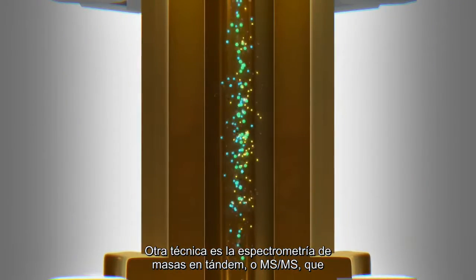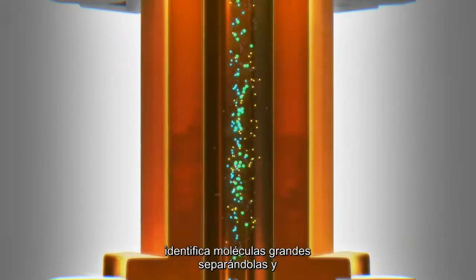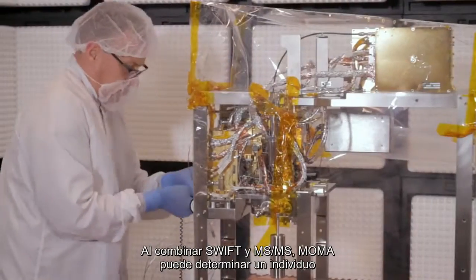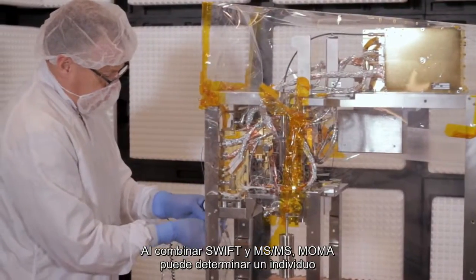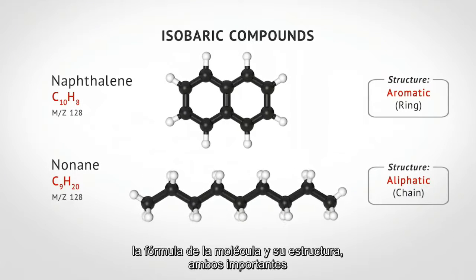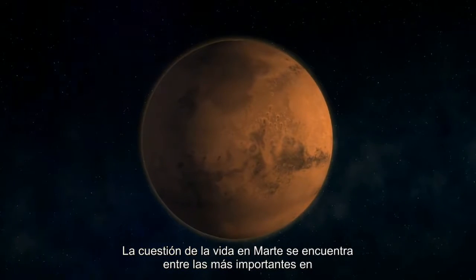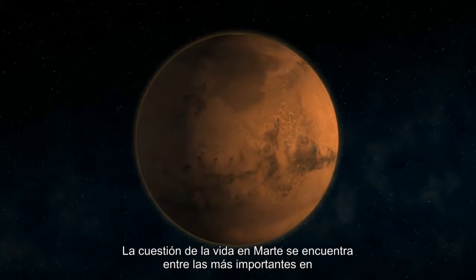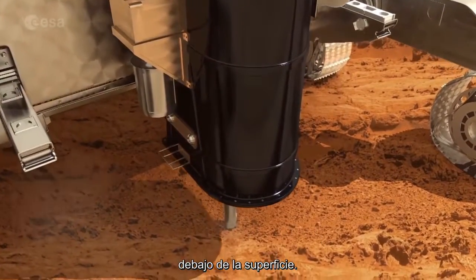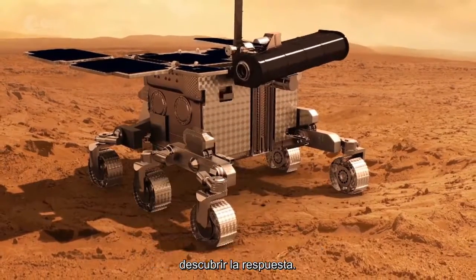Another technique is tandem mass spectrometry, or MSMS, which identifies large molecules by breaking them apart and analyzing their fragments. By combining SWIFT and MSMS, MOMA can determine an individual molecule's formula and its structure, both important criteria in the search for life. The question of life on Mars is among the most important in planetary science, and the evidence may be buried just below the surface. With the help of MOMA, ExoMars will take us one step closer to uncovering the answer.